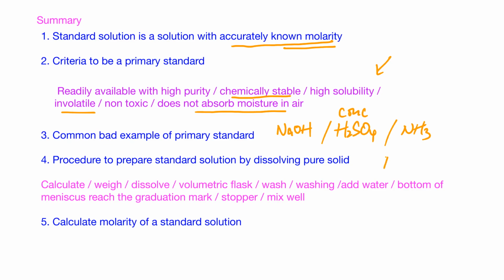The one that we commonly use is sodium carbonate. For the procedures to prepare standard solutions, I recommend you remember the keywords of each step. Say for example, calculate, weigh, dissolve, volumetric flask, washing. All these words are very important in working out the essays. And at the end, you have to calculate the molarity of your standard solution.